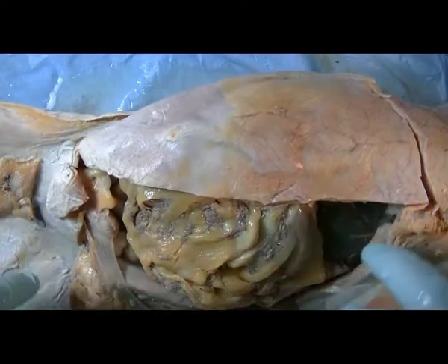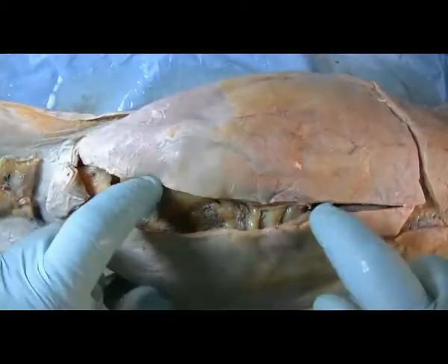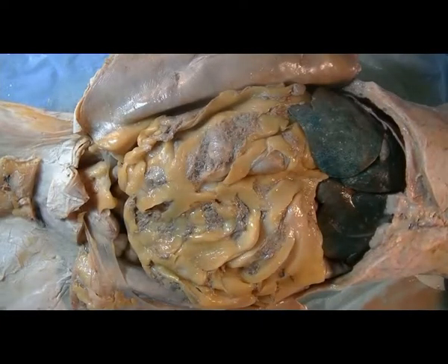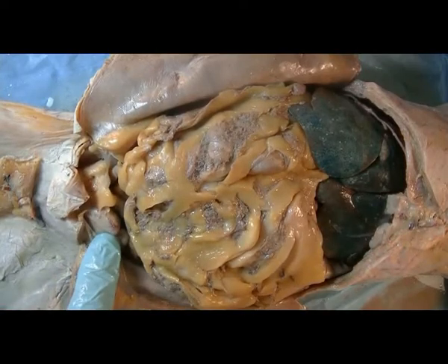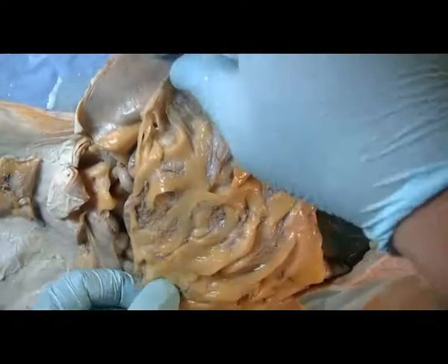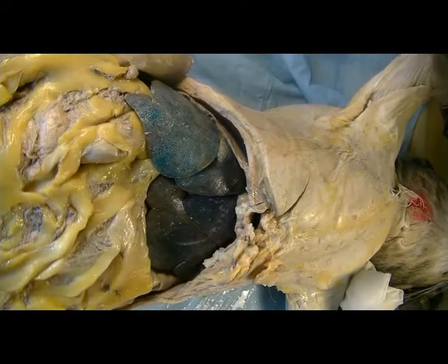I've made an H incision to open the abdominal wall, and you can see that it's an H shape by this configuration. Here's my H. So I open the flap, and you can see some of the features which we will review. Here's the liver. Down here you can see the urinary bladder, and this skirt which covers the small intestine is the greater omentum, and under the greater omentum is the small intestine.